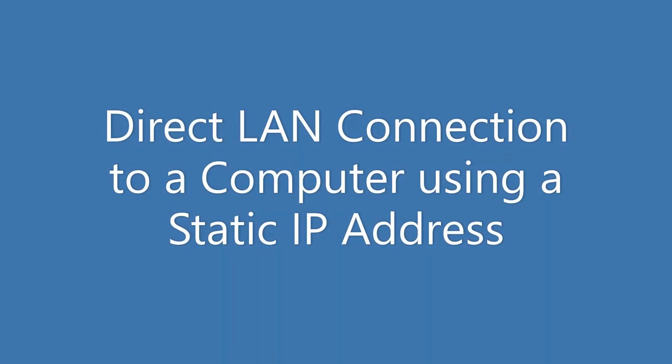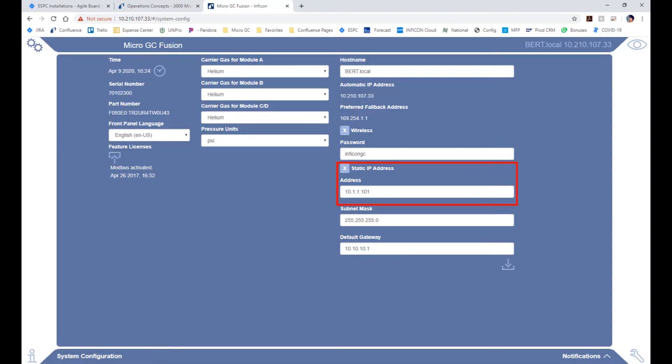Alternately, if you are doing a direct connection with a computer without going through a company network, you can assign the IP address yourself.